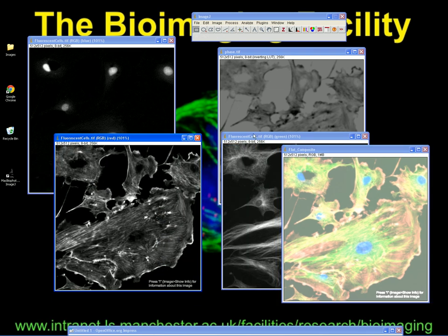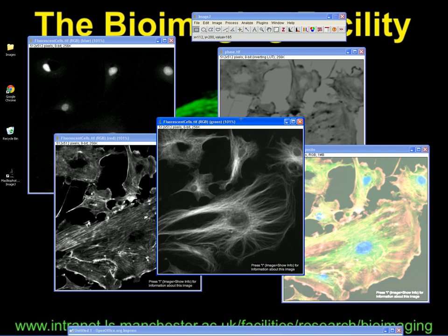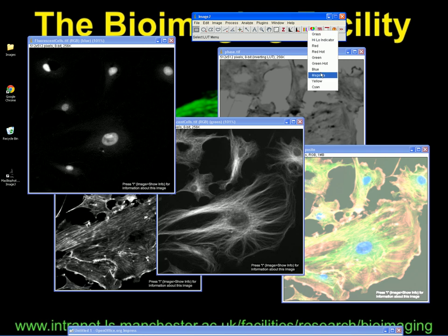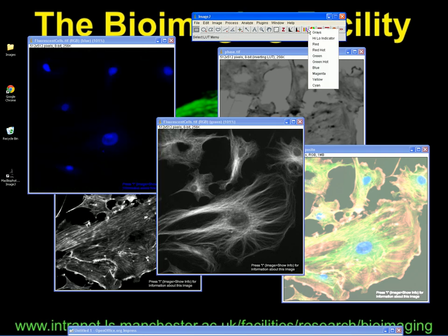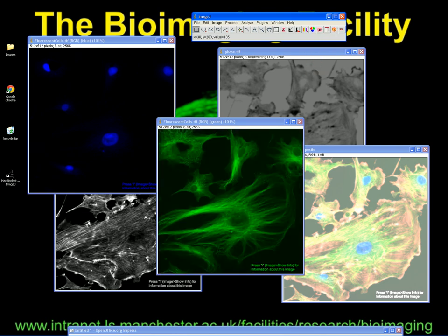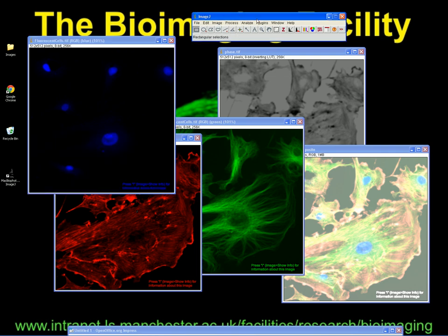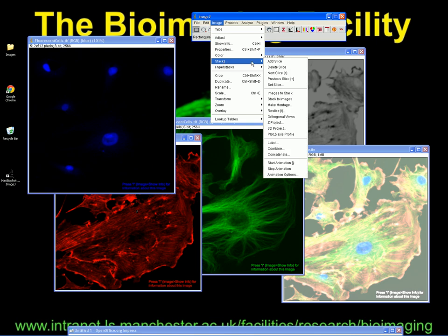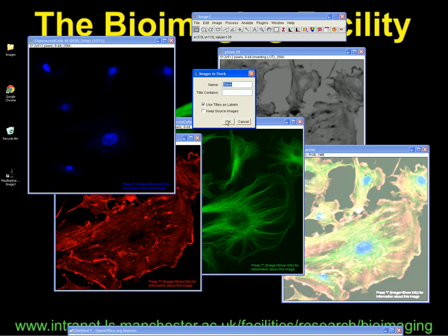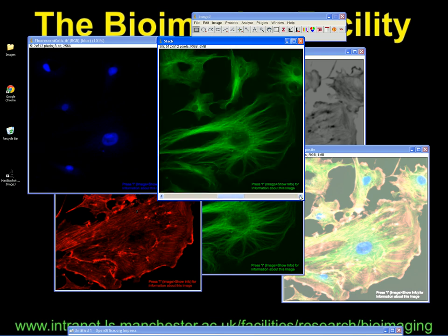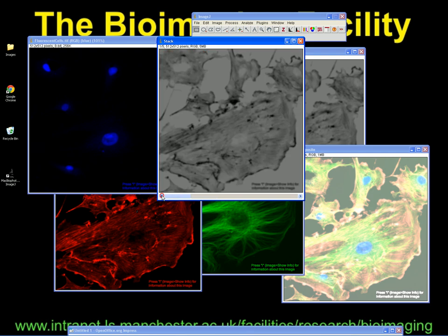And again, if you want them in colour, you can go through and apply a lookup table to each of these channels. From this point, you can then combine them together into a stack: Image, Stacks, Images to Stack. Keep source images just in case you make a mess of it. And here are your channels, which you can change the order of using the plugin.